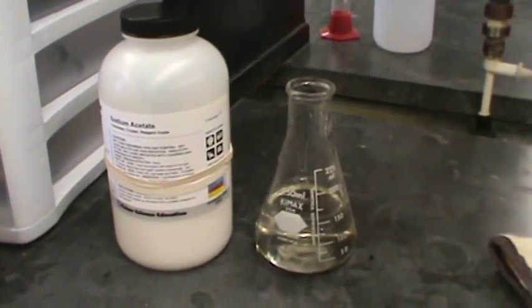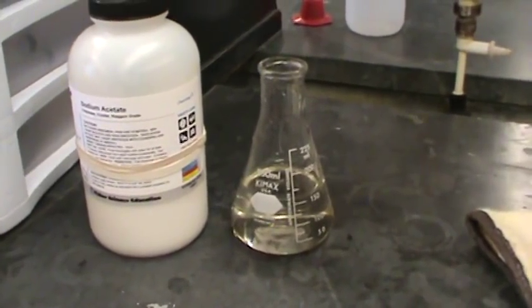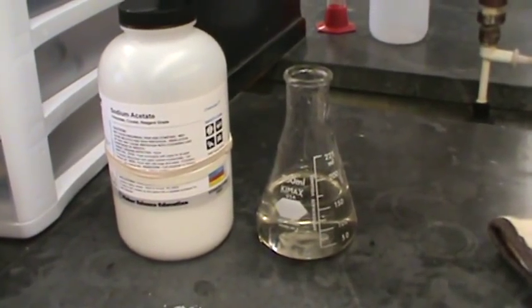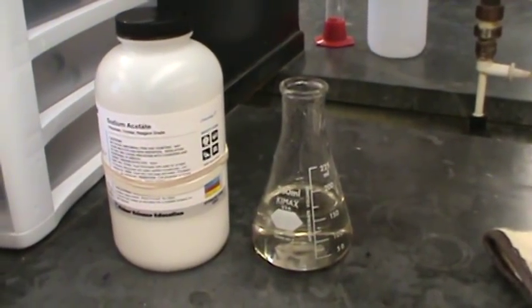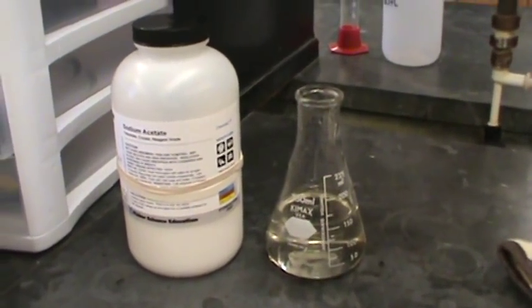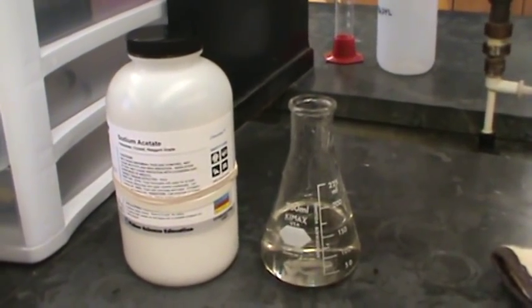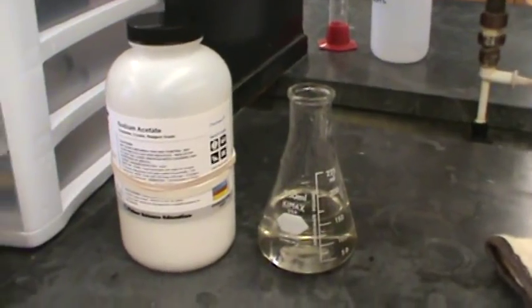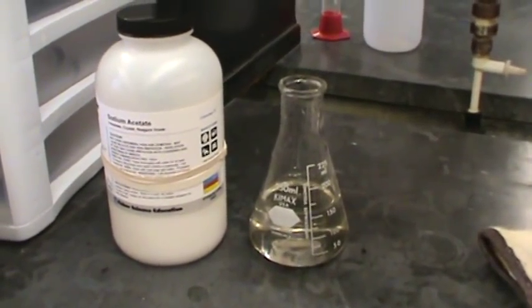Okay, on the right, in the Erlenmeyer flask, there's a supersaturated solution of sodium acetate. It was prepared by dissolving 175 grams of sodium acetate trihydrate in 50 mils of water. And you have to heat the solution to get all of the solid sodium acetate trihydrate to dissolve.